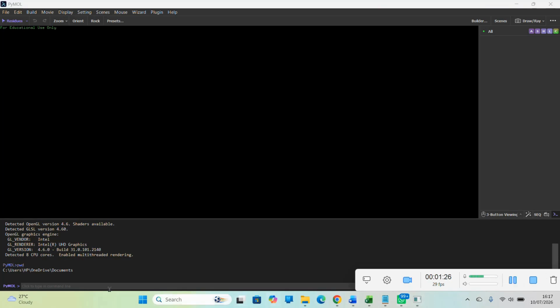So to continue, I'll type change directory, cd, and then paste the address, and then we're good to go. Ordinarily, if you have the enzyme just coming from PDB or any other database, you have to go through the cleaning steps, but we will not be doing that in this tutorial. You can see our previous videos on how to clean your protein. So I will load the protein into the working space before I start using the plugin.